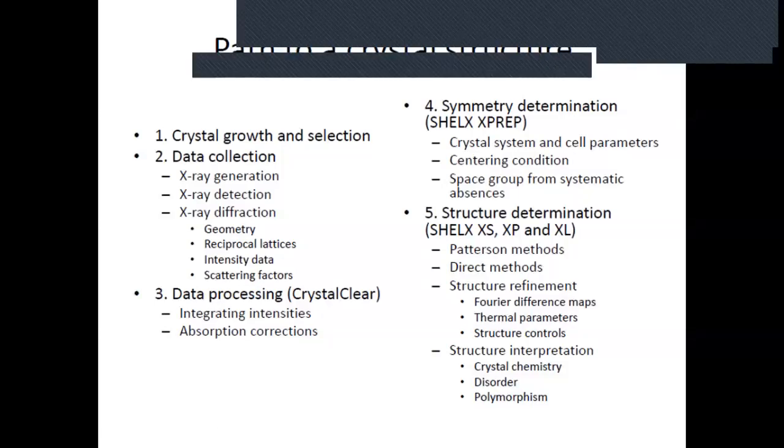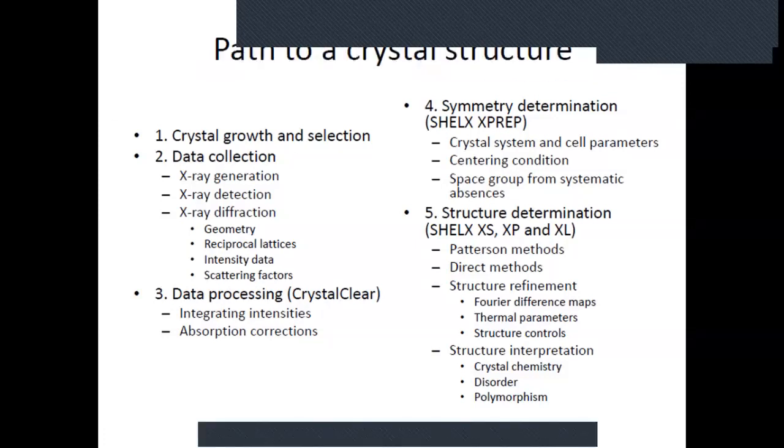and then also scattering factors. And we'll learn all about these four items when we talk about X-ray diffraction after the midterm. And then we have data processing. We'll go through this as well.